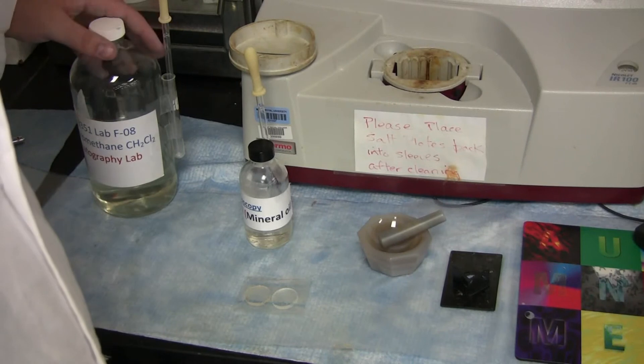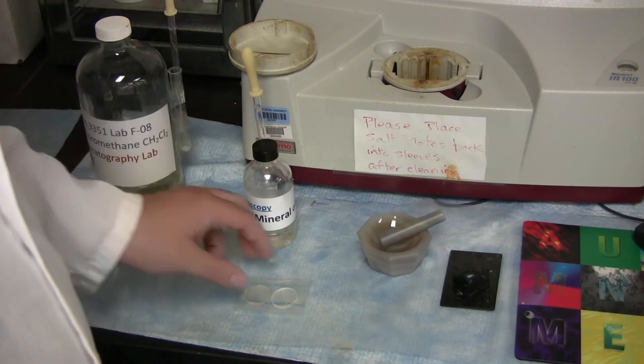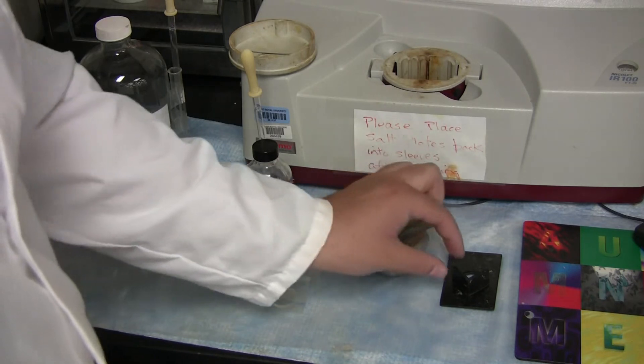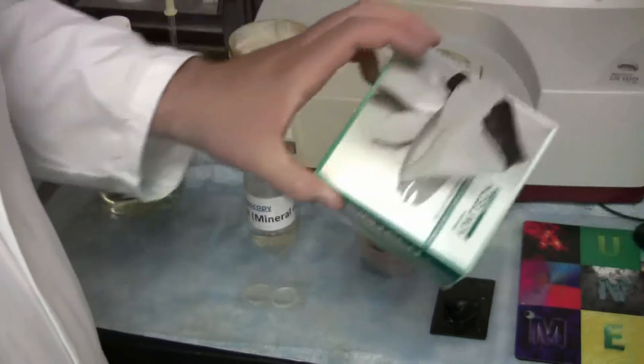You will need dichloromethane, Nujol, two salt plates, a quartz mortar and pestle, a slide, and kimwipes.